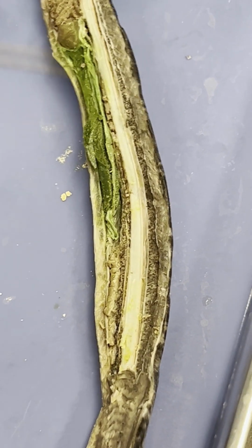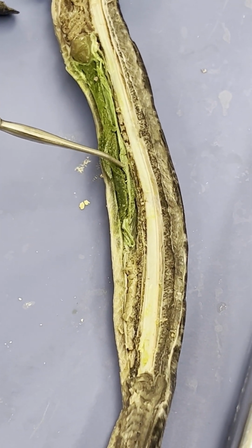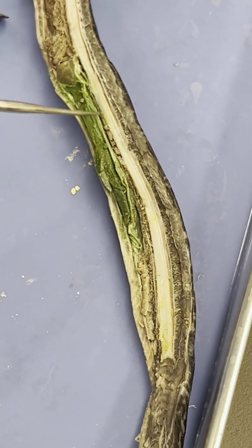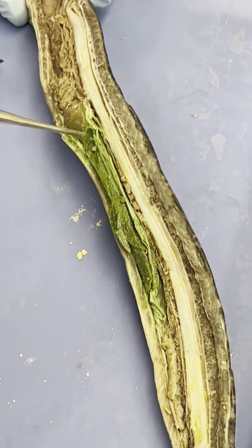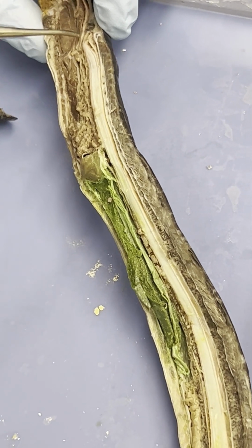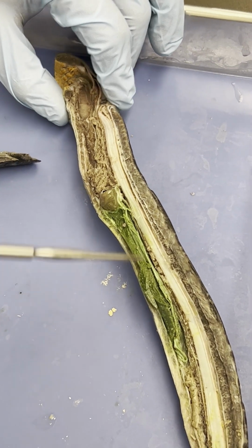Keep in mind, this animal, the lamprey, only has one intestine. There's no small intestine, there's no large intestine, and one thing that's very obviously missing from the digestive system of this lamprey is, think about it, the stomach. There is no stomach. So when the lamprey is eating something, it's basically going into the pharynx, going into the esophagus, and going right into the intestine, okay?